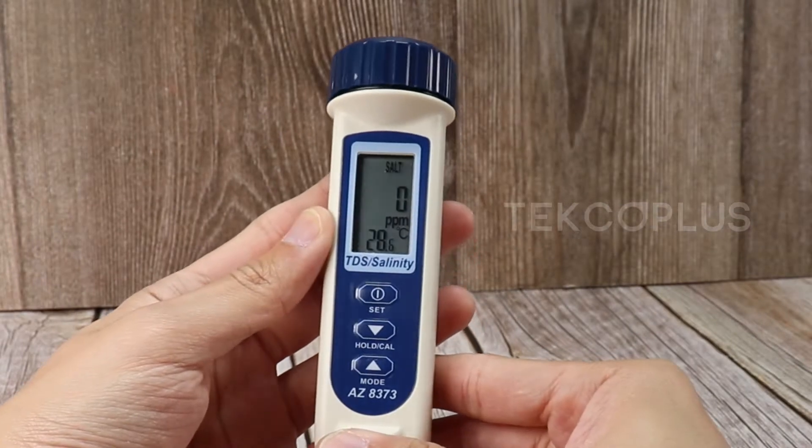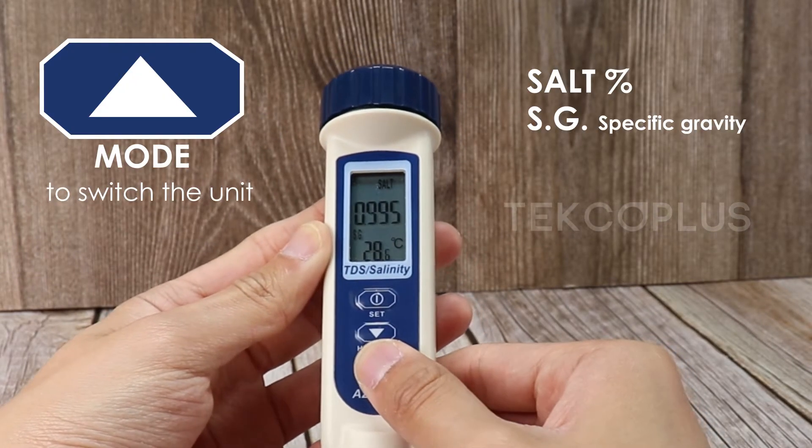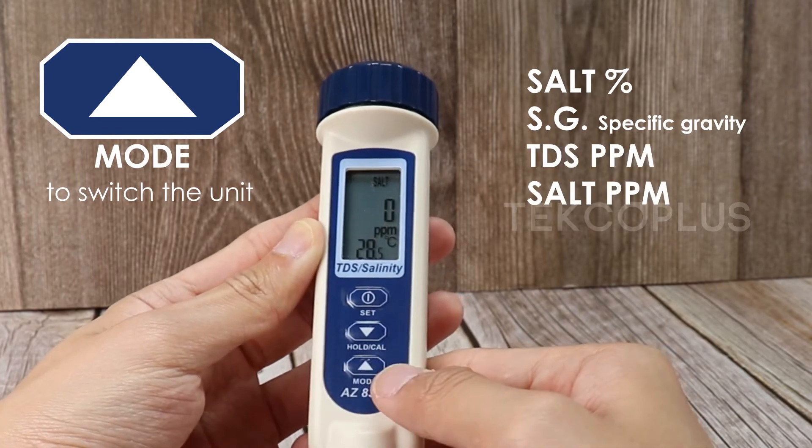Press mode to switch the unit between Salt percent, SG, TDS ppm, and Salt ppm.